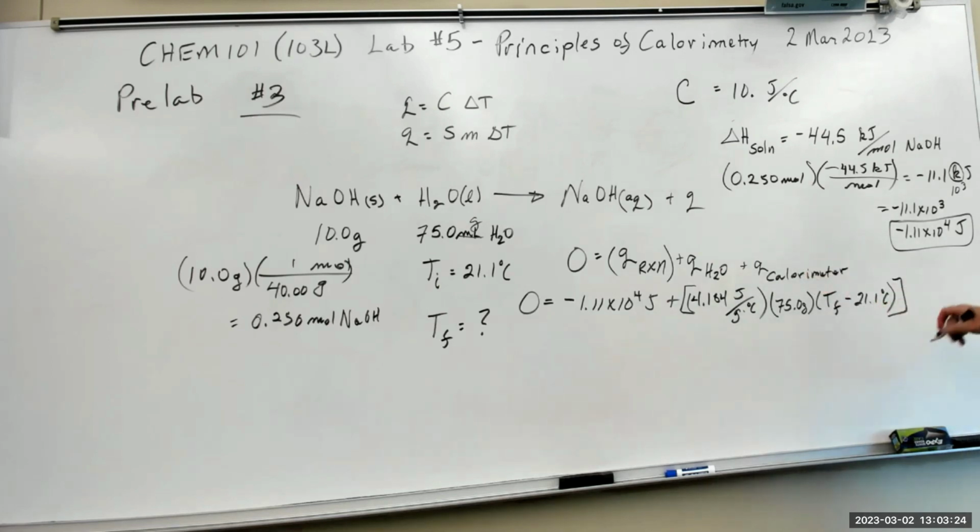The third term is the calorimeter. So the calorimeter is going to experience the same temperature change because we put the water in the calorimeter first, and that's when the temperature was measured. So they're both at the same temperature, the calorimeter and the water.